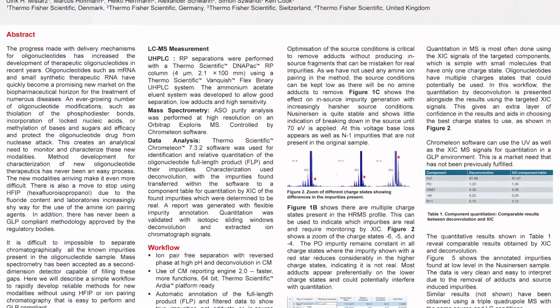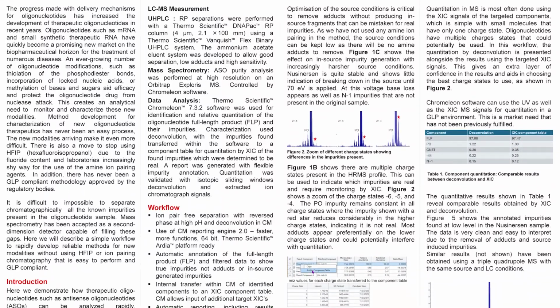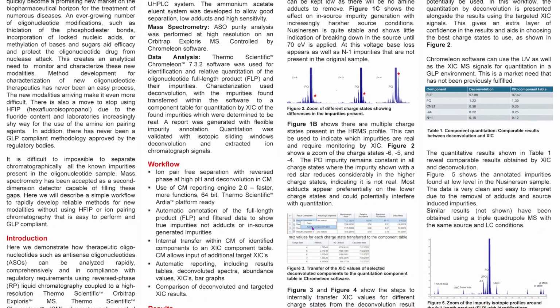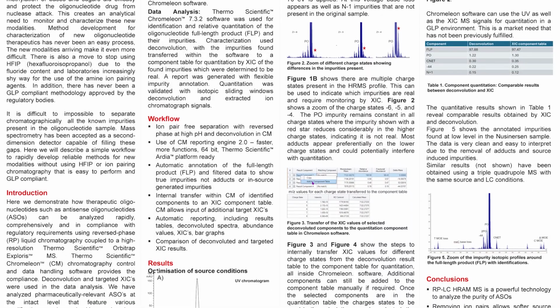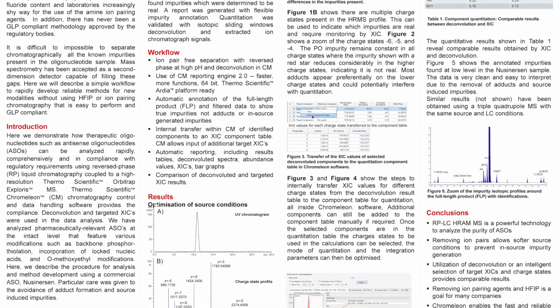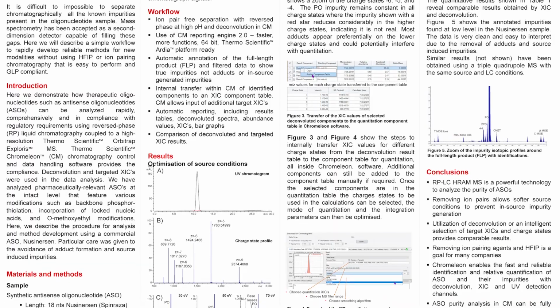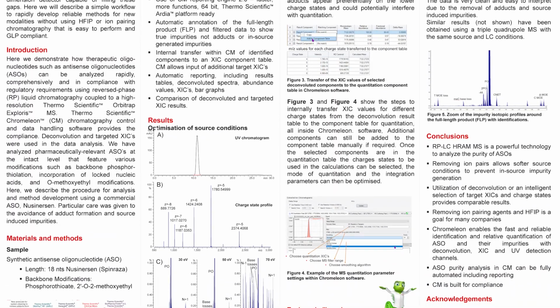What was your main research question and how did you go about answering it? It's difficult to actually develop a green chemistry. To get a fully green chemistry, you shouldn't be using high amounts of solvent, you shouldn't be using chemicals like HFIP, and there's very limited chemistries you can use to do this. Most of the industry's gone to HILIC mode, and that gets rid of the HFIP, but it still uses an extremely high amount of solvent.